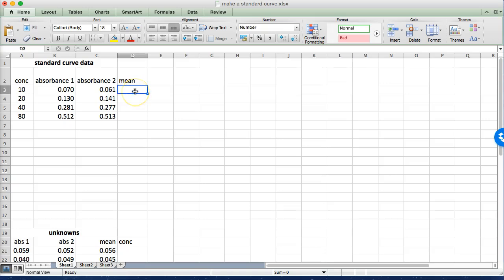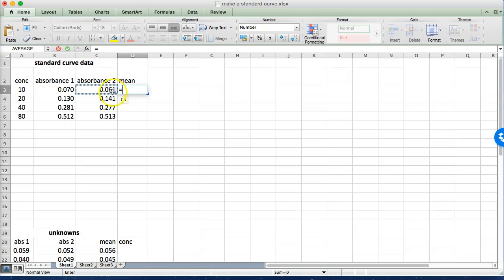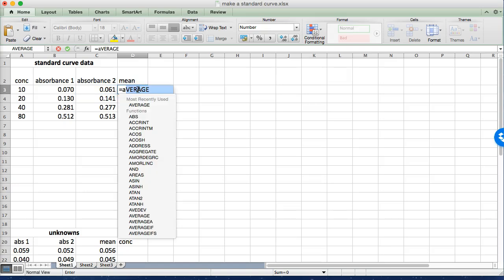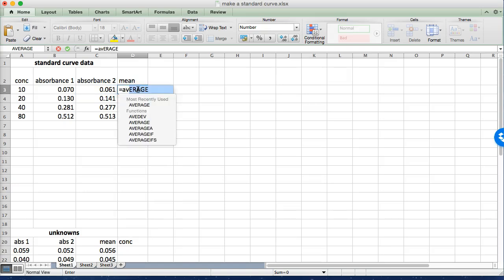In Excel when we're going to put in a formula we start with an equal sign and we could just type in the actual formula for calculating an average. But instead we're going to use Excel's built-in formula. To find that we just start typing average and it will come up in the list of formulas.